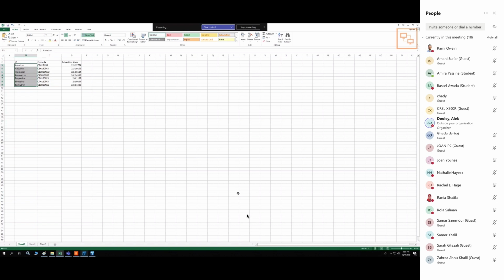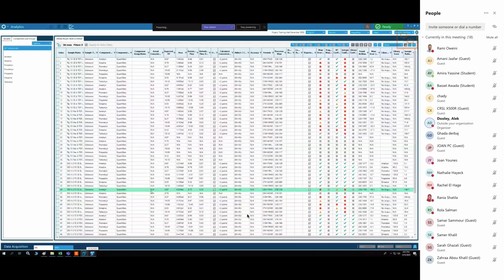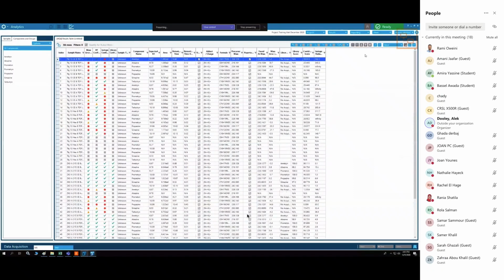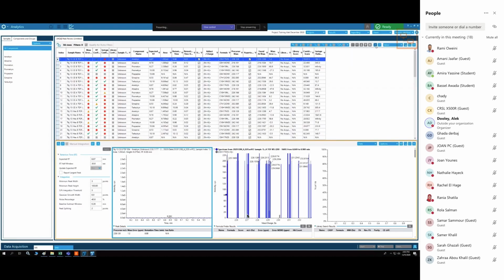Here it is. All right. So here's our data. And what do we want to see? We want to have our nice columns that we all spent that time laying out. Recent settings, my settings. It jumps to there. And then we click on review. So we can see anything.